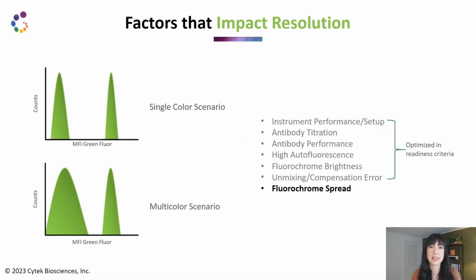Now, to analyze this data, you're going to be comparing the single color cells to the multicolor cells and assessing resolution.